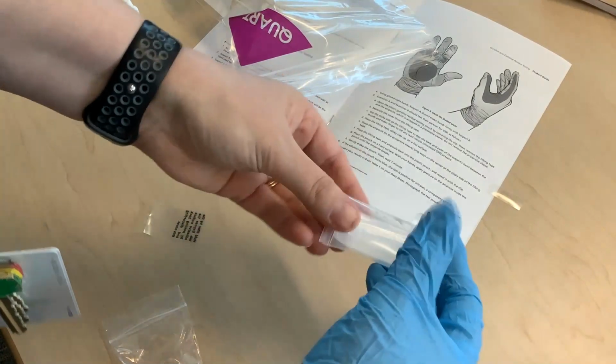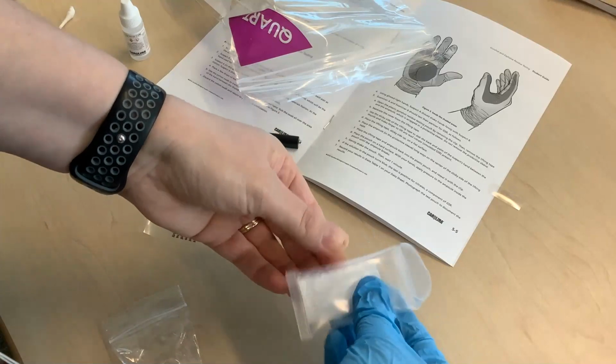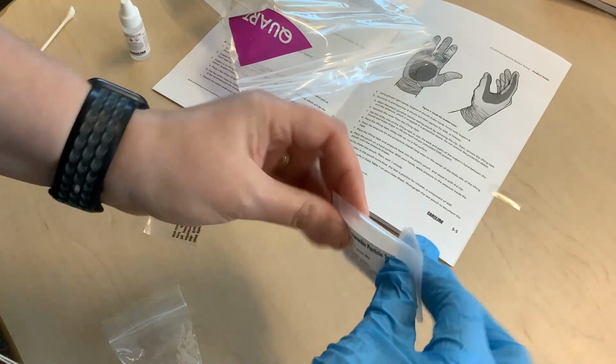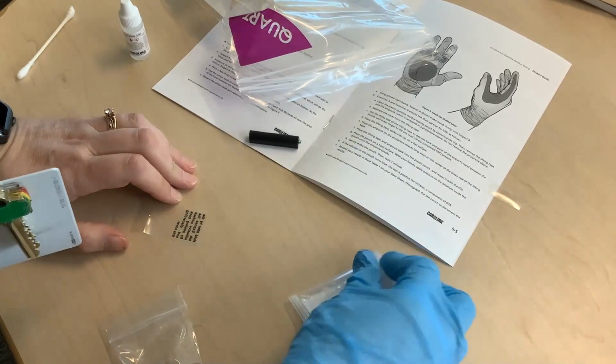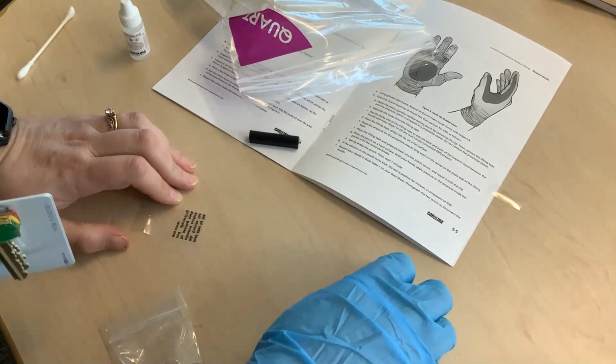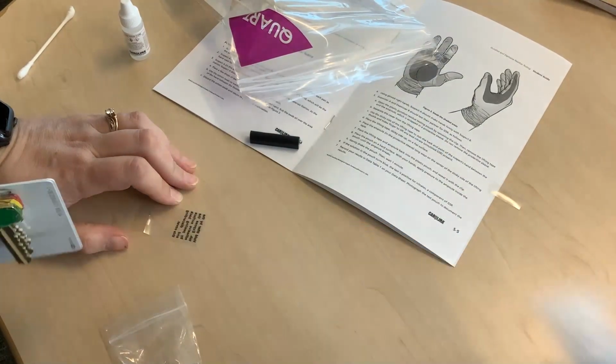And then you can shake it around and observe your results. So I'm moving that around. Place the pouch on a hard surface with hands, apply pressure. Gently shake the pouch, then wait 1 minute.